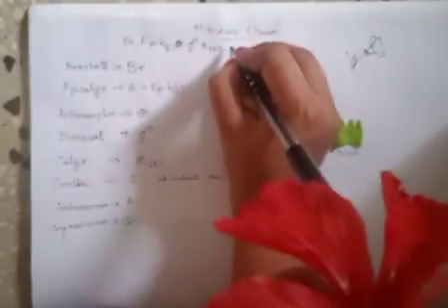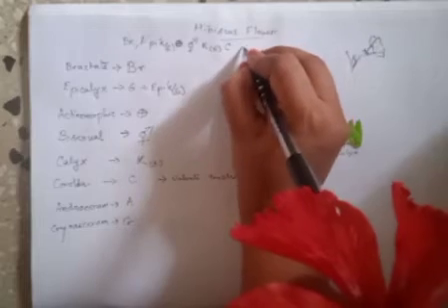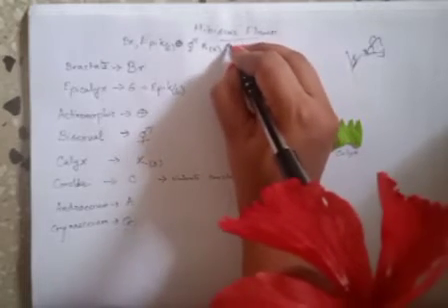So you see, it is the petal that we have, it is fused with the stamen. So whenever I am writing about the corolla and the androecium, because it is linked, I will give an arrow like this. So now I am trying to remove it out slowly.